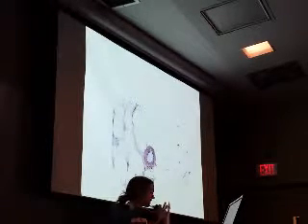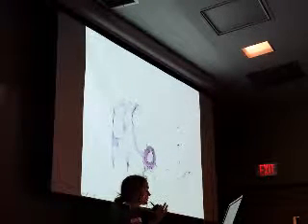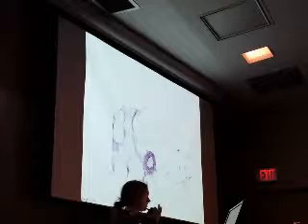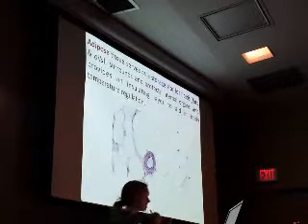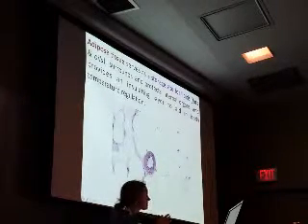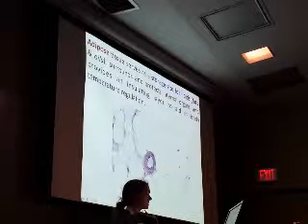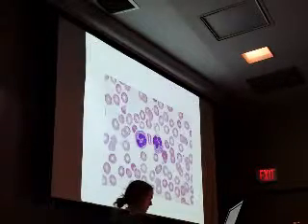And of course, when the body is burning fat for energy, the fat mobilizes out of these droplets. So one huge white cell, the whole cell is taken up with fat droplets, right? Fat mobilizes out of the cell, the cell shrinks, and of course you always hear, well, that's why it's so easy to regain weight, because the cell stays there and is able to just regain its previous size. Adipose tissue, very distinctive characteristics. So you see these huge blobs, those are fat cells. This is a bit of epithelial tissue in the middle. So life is not always so black and white.